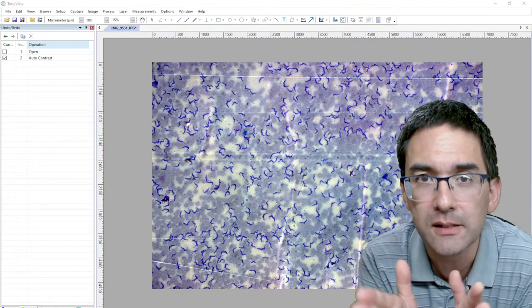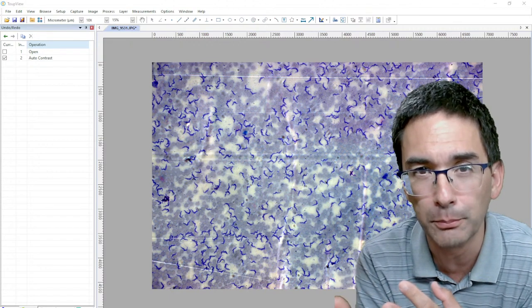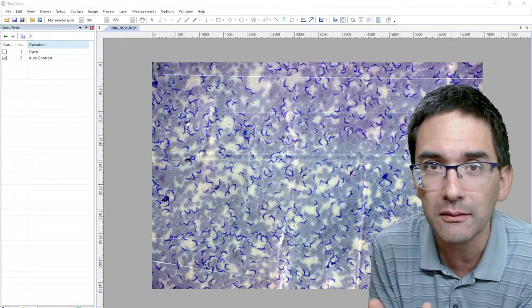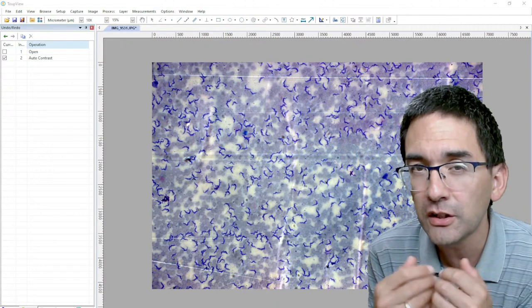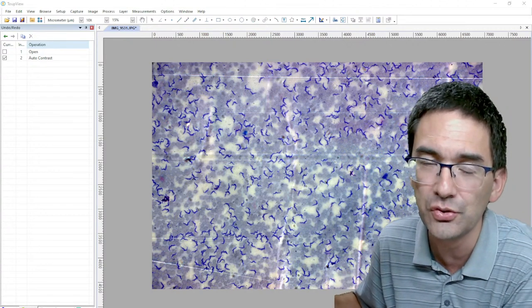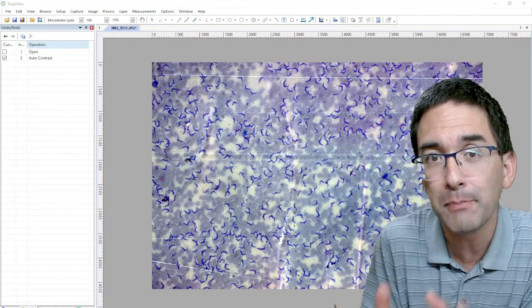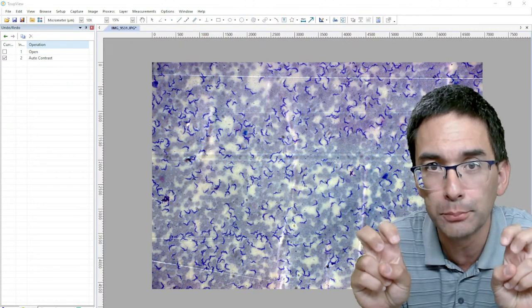And I understand that there is a fine line sometimes. However, I think it depends entirely on the purpose. A picture that is there to communicate, and if you do not see something properly, because the microscope or the lighting system or the camera system is not able to capture it properly, then I think it's okay to adjust it, okay? Because you want to make your point, you want to communicate something. When you say you're introducing a bias by adjusting the image, I can say the microscope also already introduces a certain bias. There are lens errors that are introduced. There are filter settings. There are condenser settings, and so on. So you might also transfer this bias away from the digital image processing towards the microscope. Because you can say that even the microscope kind of interprets nature.